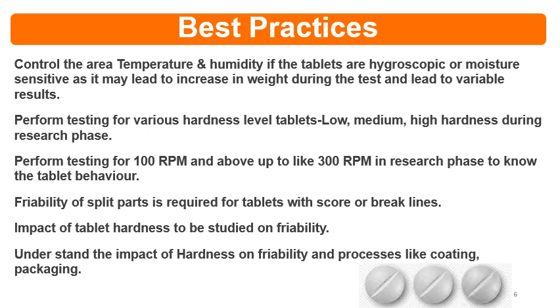Perform testing for various hardness levels, that means low, medium and high hardness levels, during the research phase. If you are working on a tablet formulation and developing a formula and a product, then with the development trials you have to perform the friability testing with low, medium and high hardness. Then you will get to know what is happening to the friability in relation to the hardness.